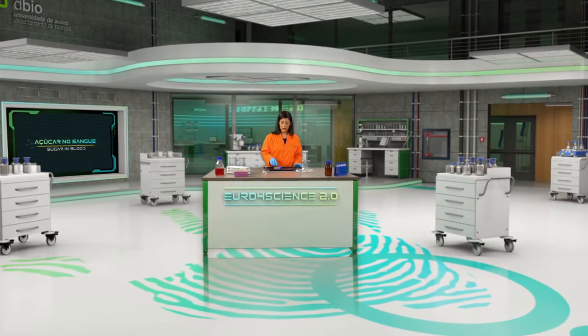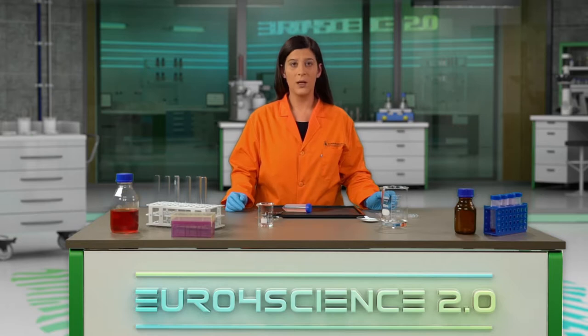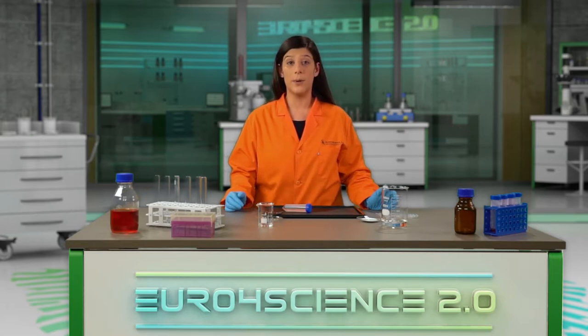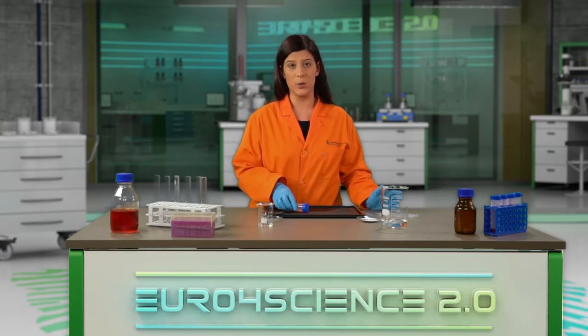Hoje temos aqui uma amostra de um líquido que foi encontrada no local do crime. Pensámos que será uma solução açucarada. Sabemos que a vítima sofria de diabetes e por isso é extremamente importante perceber se a quantidade de açúcar presente nesta amostra contribuiu para a sua morte. Necessitamos então de uma escala de cor com concentrações conhecidas para que as possamos comparar com a amostra recolhida.